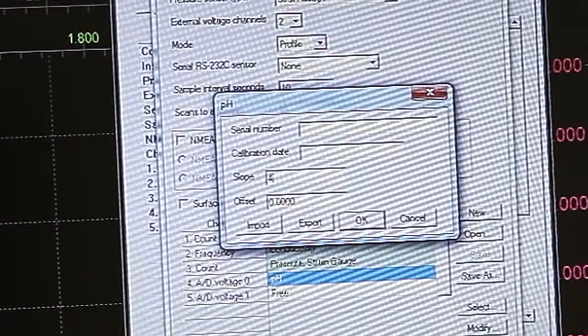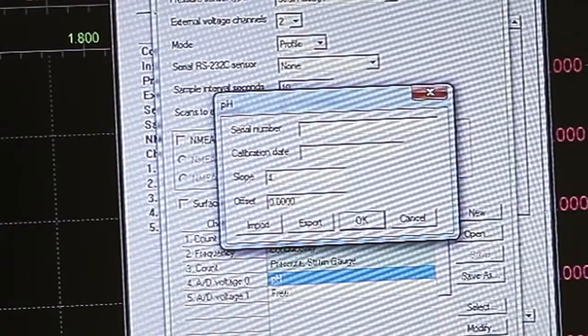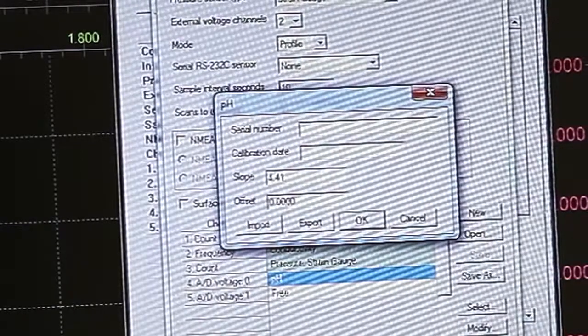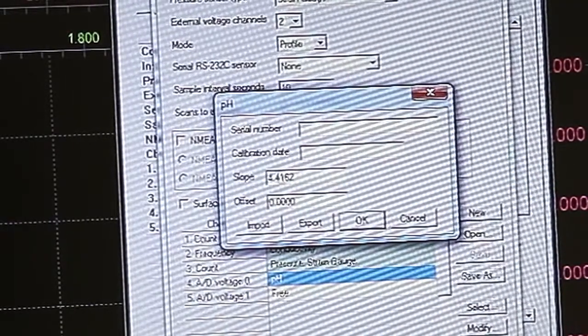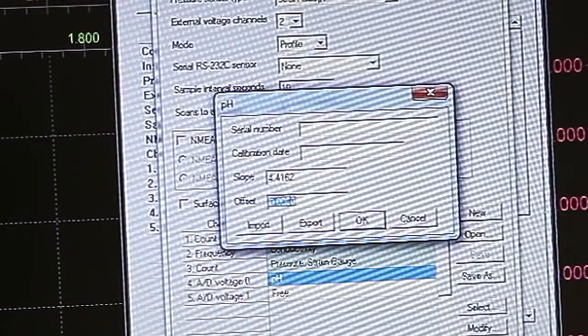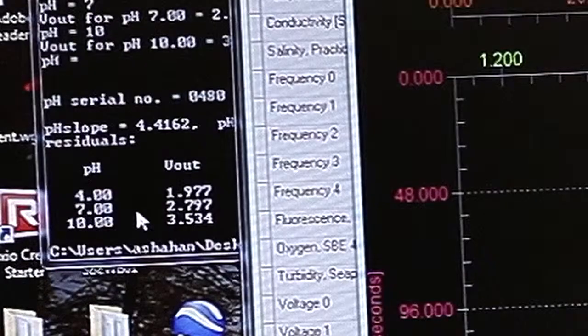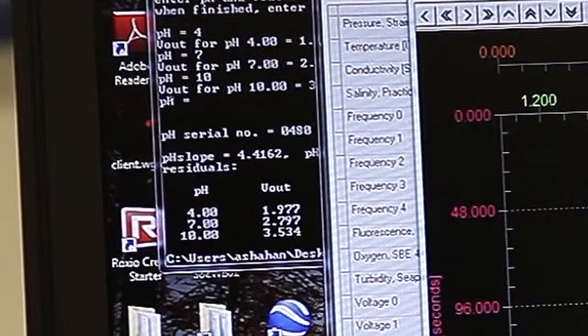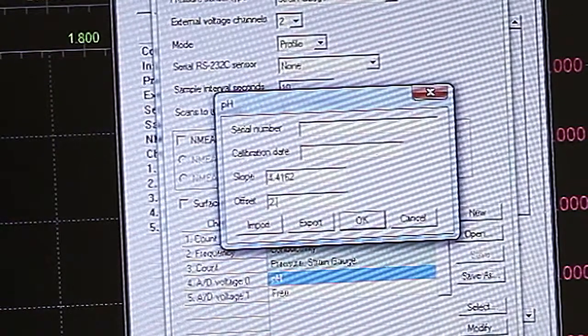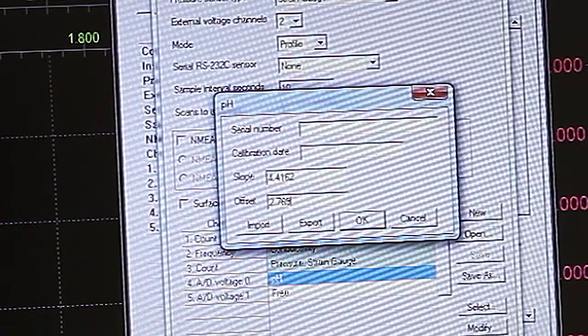So in this case 4.4162 and an offset of 2.7693.